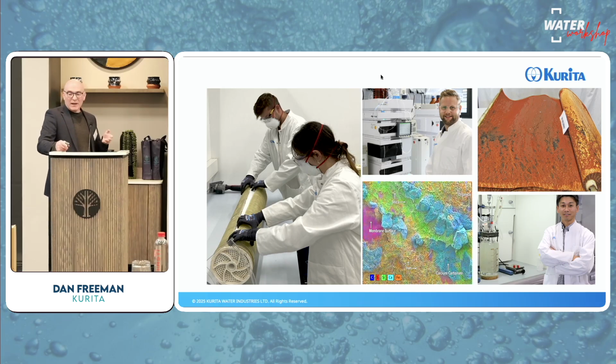In fact, it is the best way to really understand what's going on with the membrane. We can see exactly what's on the surface. We can see quite a lot of the history of the membrane from an autopsy. We can also see if there are multiple issues. And in most cases, I would say, there is more than one issue with an RO membrane when we break it open and have a look.